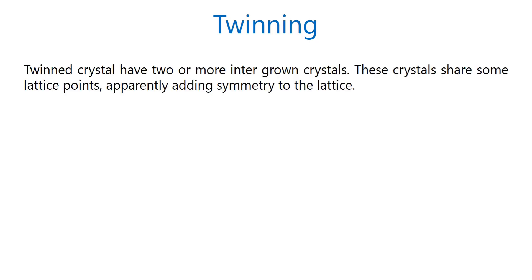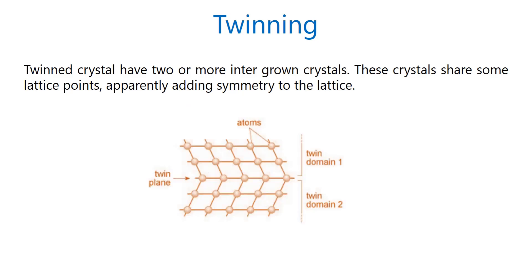First of all, what is twinning? Twin crystals have two or more intergrown crystals. These crystals share some lattice points, apparently adding symmetry to the lattice. For example, this diagram is showing the twin components — twin domain 1 and twin domain 2.